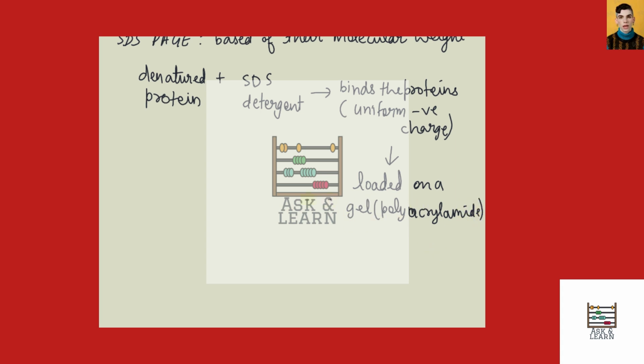Now when electric current is passed through this gel, various proteins move under the influence of electric field.